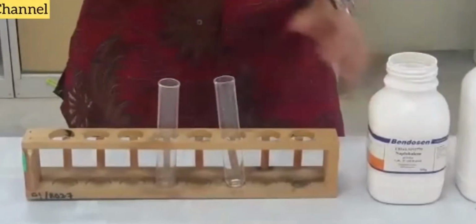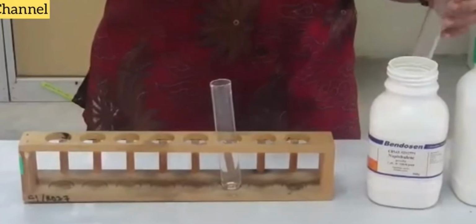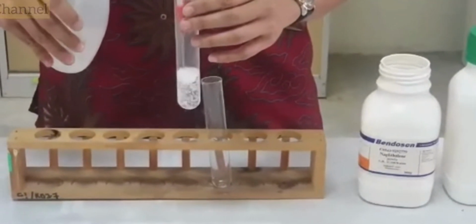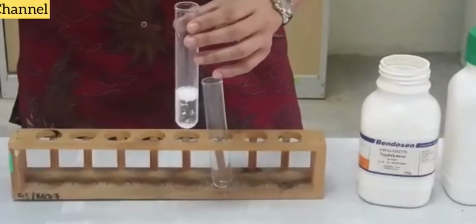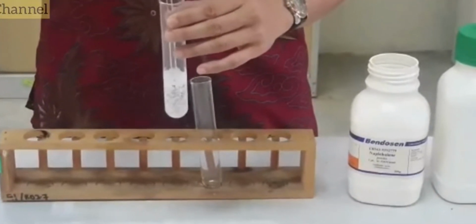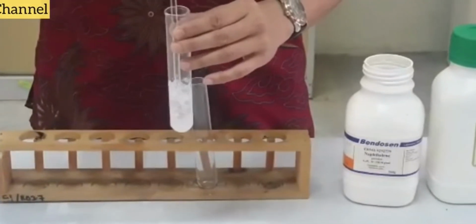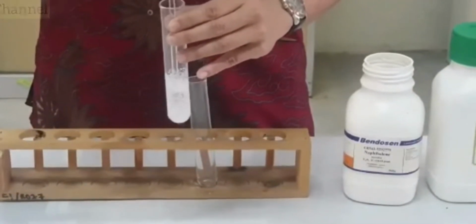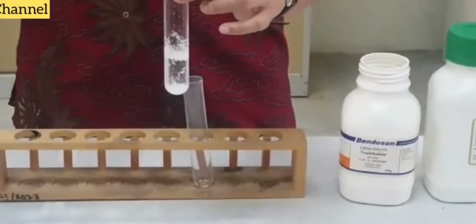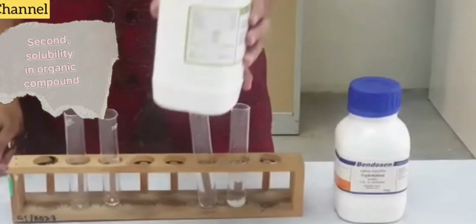Now for the naphthalene, take some of it into the test tube, pour in some water. Naphthalene is a covalent compound. Take a glass rod and stir it together. 我们还是看到那些白色。You can see the naphthalene does not dissolve in the water. Now let's start using the organic solvent.